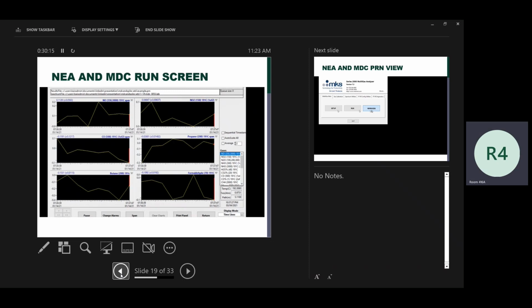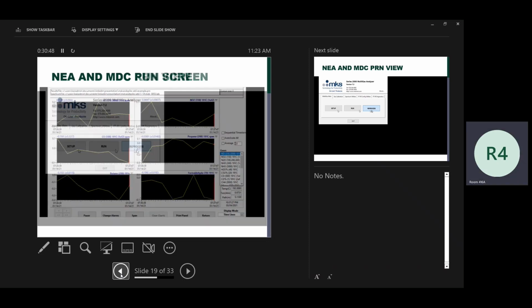is the fact that your MDC is not going to be the same. Statistically impossible to have the same MDC across different labs, same MDC in the same day. For the same lab, it's statistically impossible because you're looking at 8 different recorded numbers based off of a different background from a different instrument or from the same instrument. So that background's going to change all your zeros. So you start saying, okay, what is this MDC going to look like? Is it going to be plus or minus zero? Yes. But the method doesn't say you're going to be plus or minus zero for MDC. The method says you're going to do the zero. That's a sticky point that a lot of people have missed.